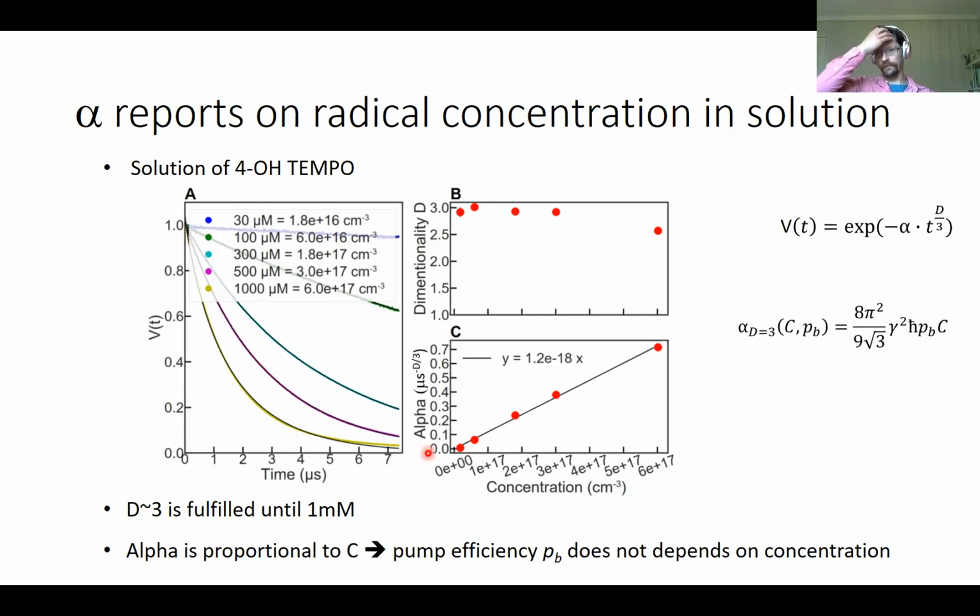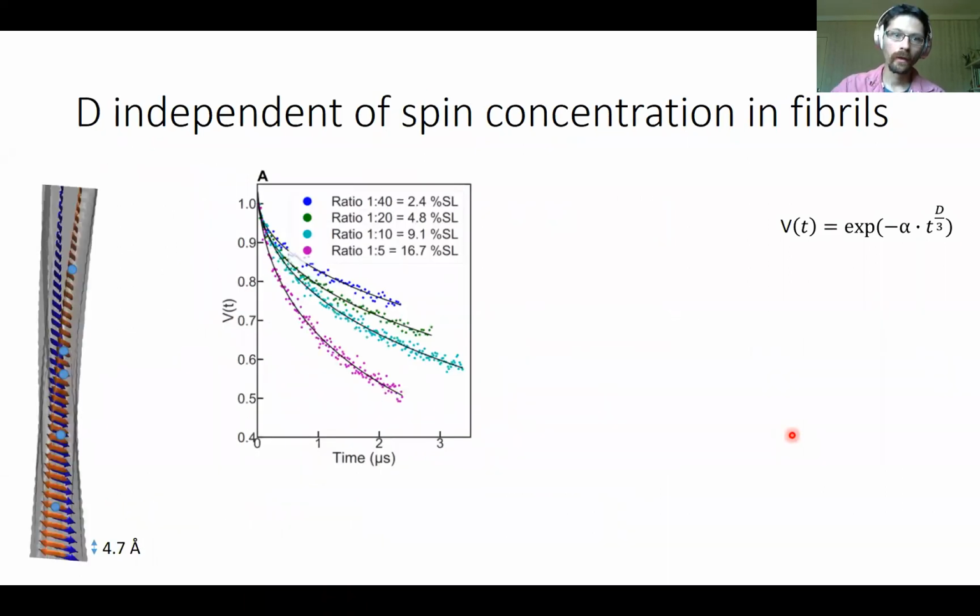And for instance, if you have a protein in solution of a known concentration, then you can measure spin label concentration, and you will get a spin labeling efficiency. I know usually you do that with quantitative CW EPR, but in some conditions, this is actually a convenient way to get some information. All right, so now let me switch back to my fibers.